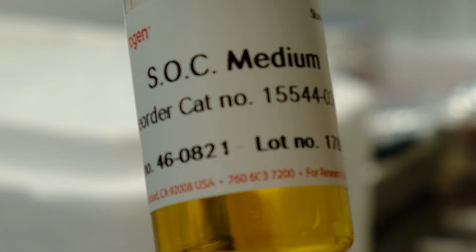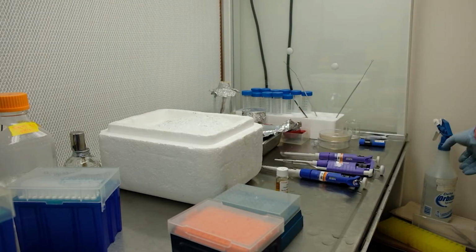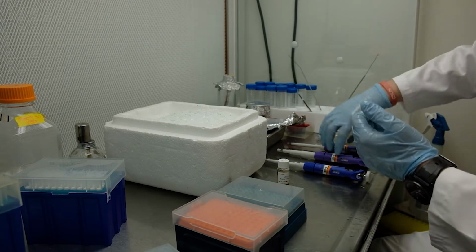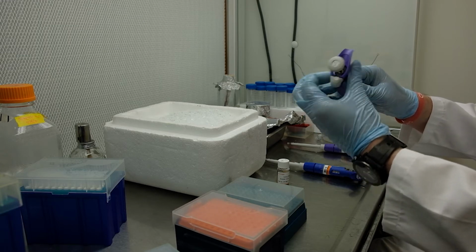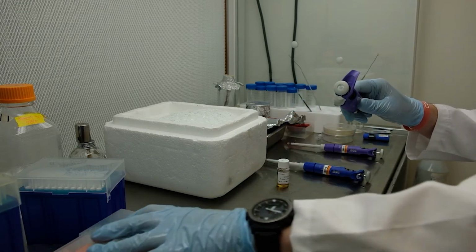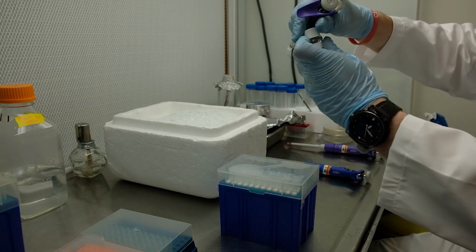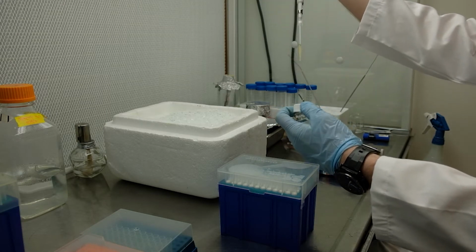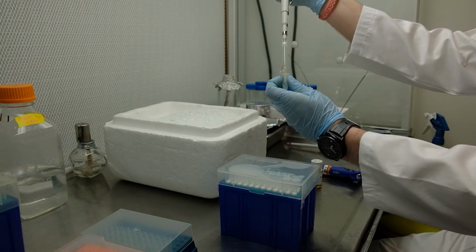For the next step, we will use SOC. Watch out, it's very easy to contaminate. All you need to do with SOC is add a certain amount of it to each of the cultures.